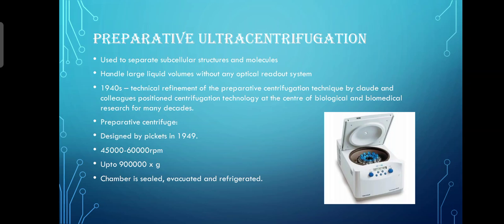In the 1940s, technical refinement of the preparative centrifugation technique by Claude and colleagues positioned centrifugation technology at the center of biological and biomedical research for many decades.